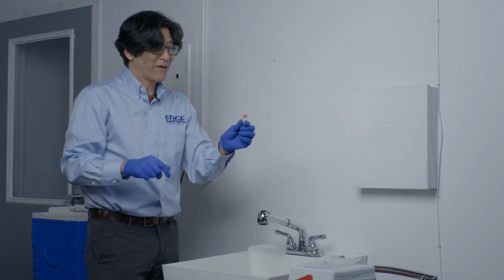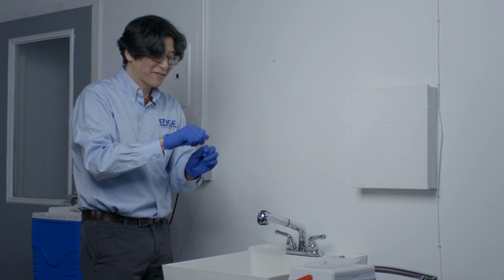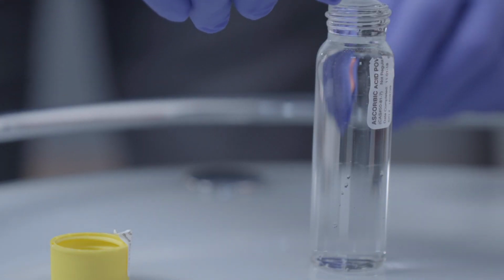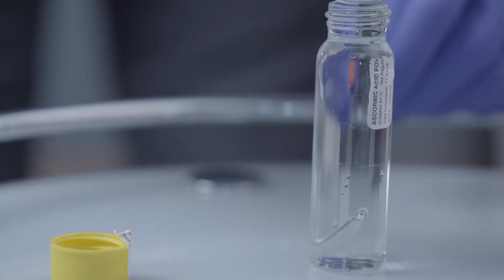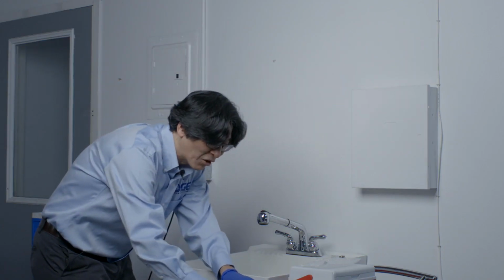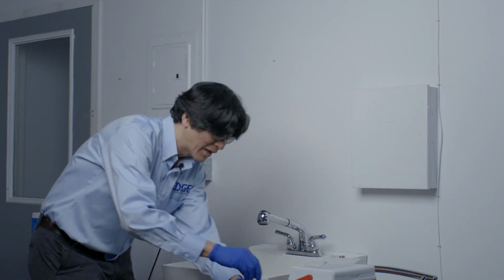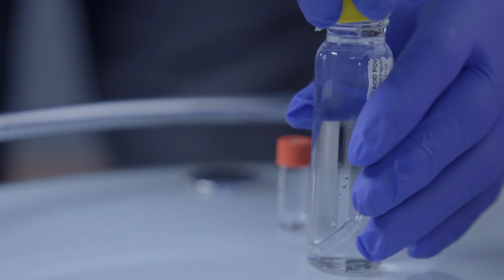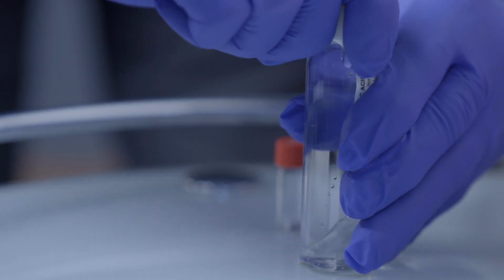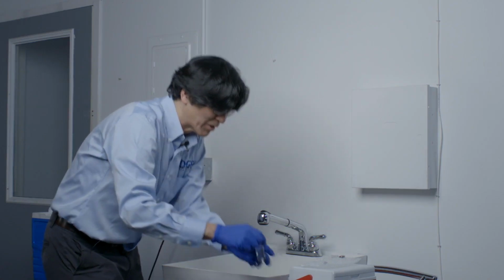Now we're going to take this red cap vial and we're going to drop the little glass insert inside right into our sample. So here we go, we drop that down, in it goes, we cover this right back up. You see we still have that nice dome on top of our sample. I am going to just place my cap right on there. Give it a nice firm tightening.